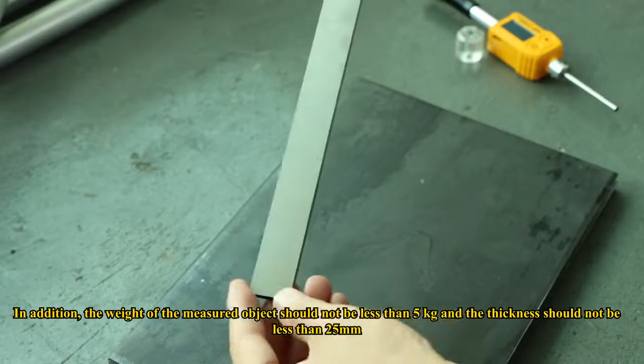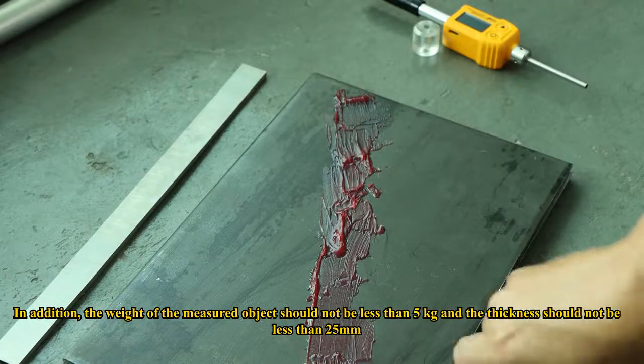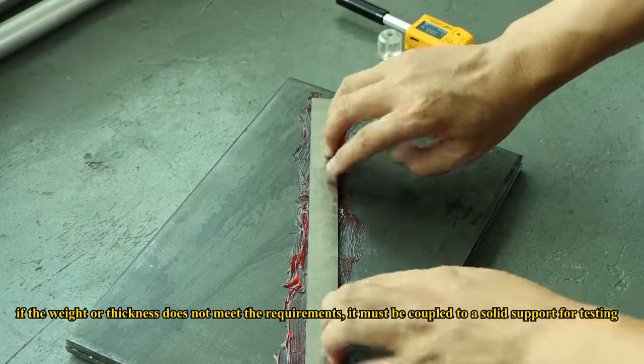In addition, the weight of the measured object should not be less than 5 kg and the thickness should not be less than 25 mm. If the weight or thickness does not meet the requirements, it must be coupled to a solid support for testing.